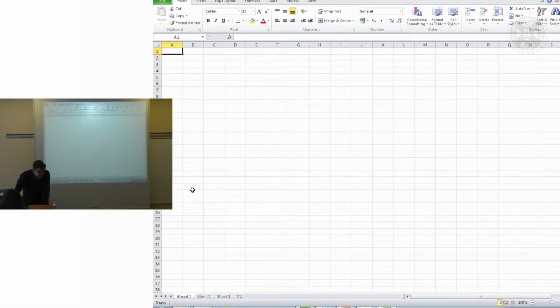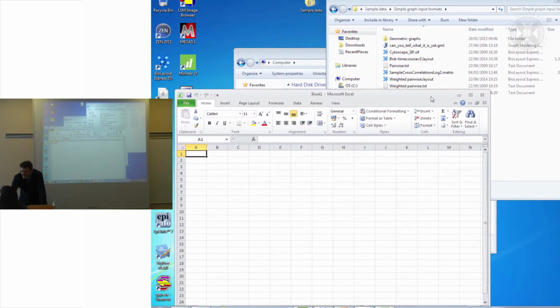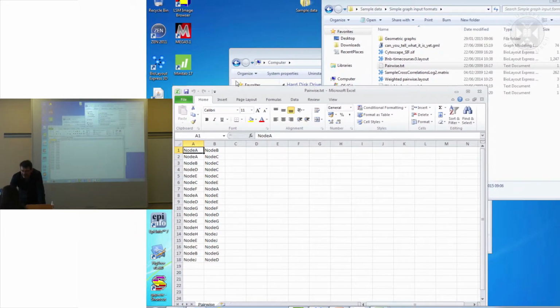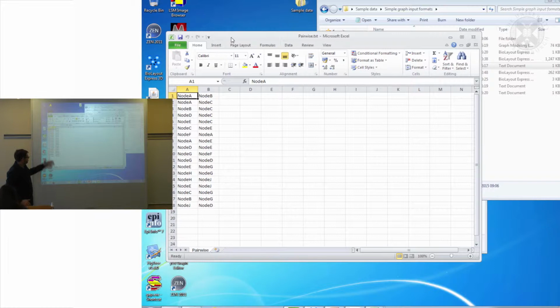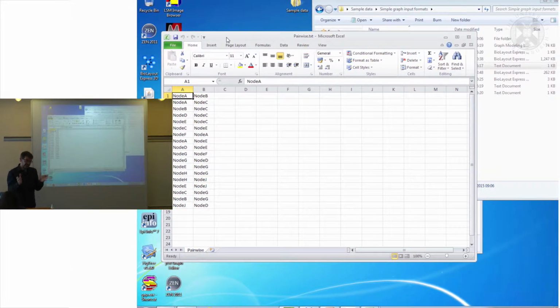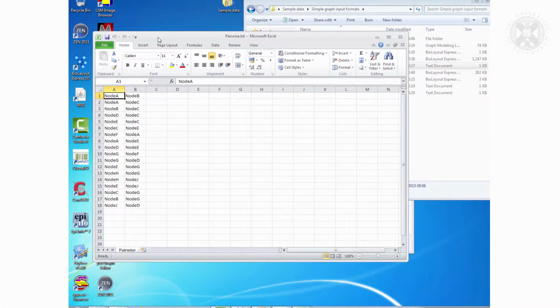For the most part, you can put most of the input files together as a text file or a simple .txt in Excel. So a lot of the data preparation you can do in Excel. Excel is quite a powerful tool. You all know how to use it, or the basics of it. So being a ninja with Excel is quite useful for preparing data.